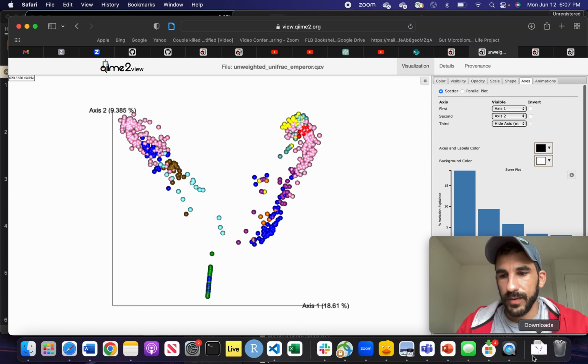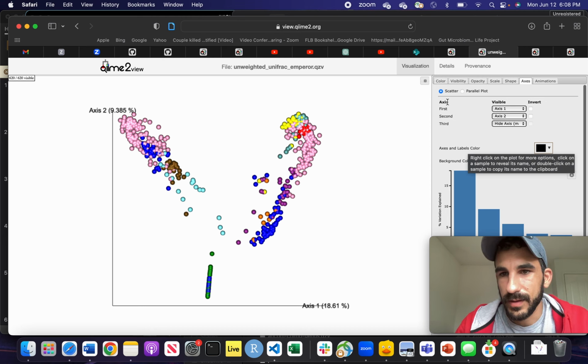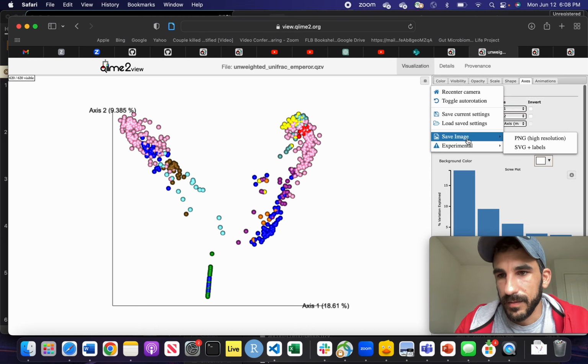And this will just give you a really nice high quality figure, because you can see it's kind of fuzzy and weird here. That will be high quality. And then you can put it in PowerPoint or whatever software you want and attach the labels.